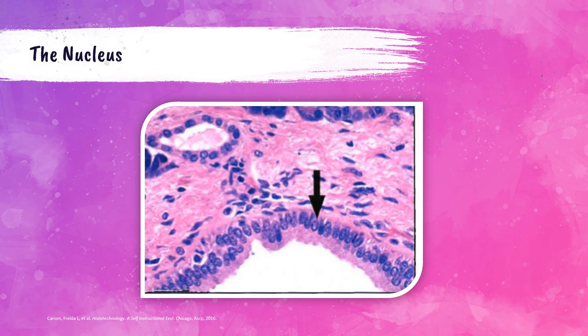This is a photograph of simple columnar epithelial cells of the pancreatic duct. The arrow is pointing to a row of nuclei — see how dark purple or dark blue they are. These are the nuclei, which is the plural term for nucleus, and those are basophilic — that dark blue or purple color.